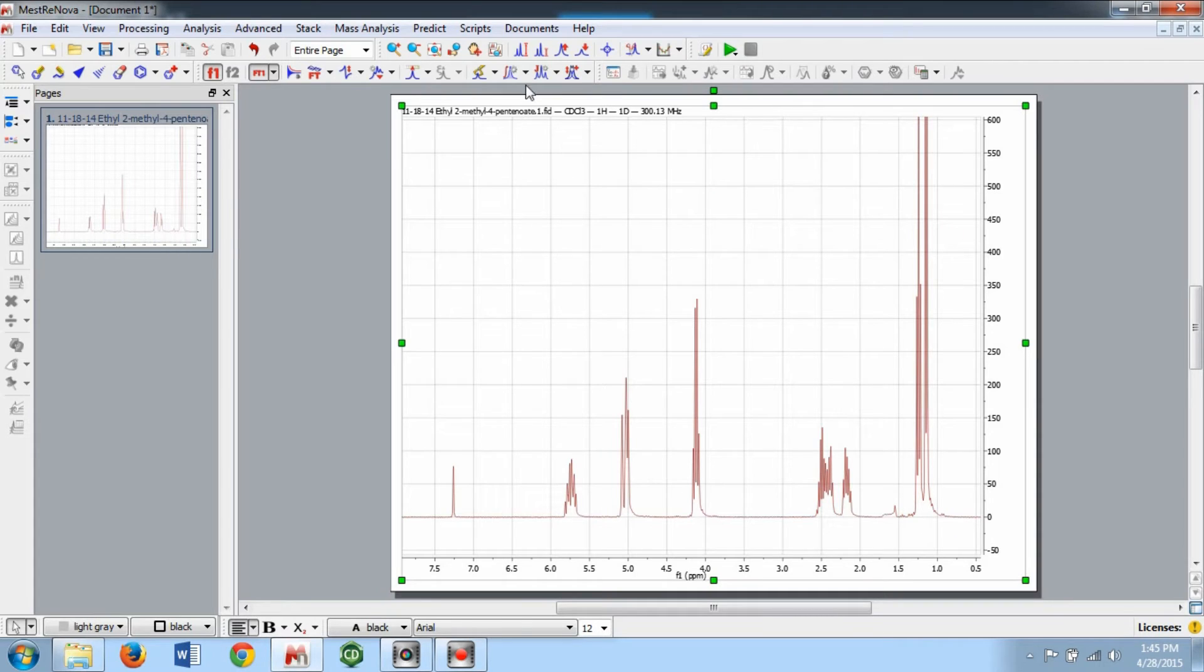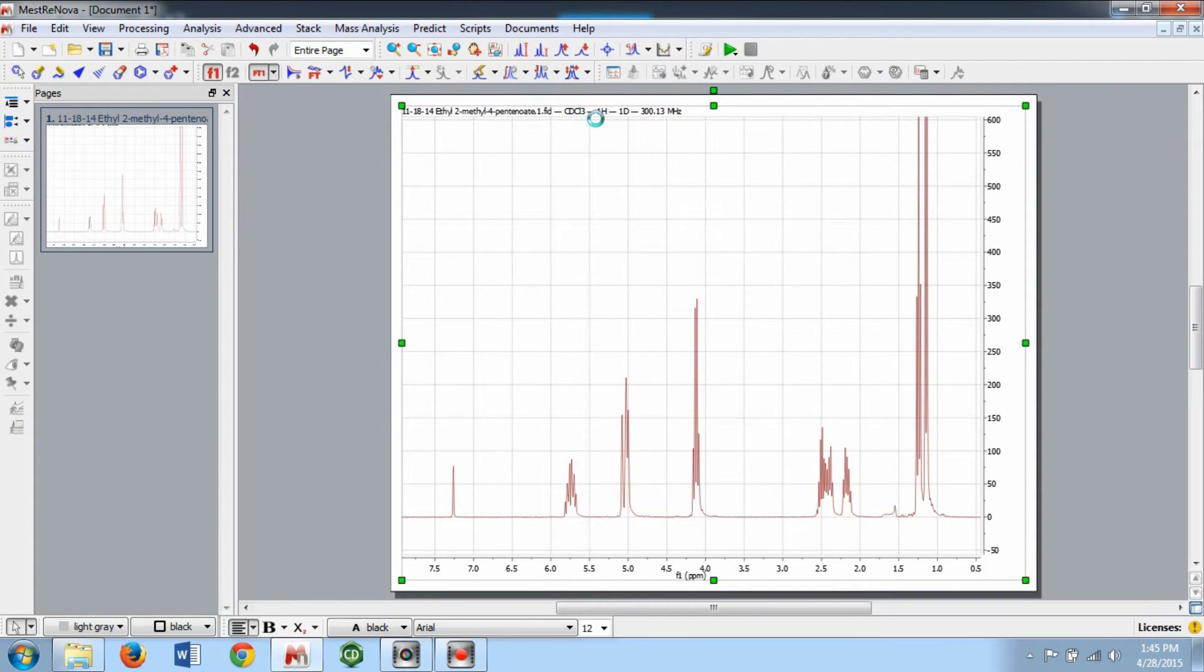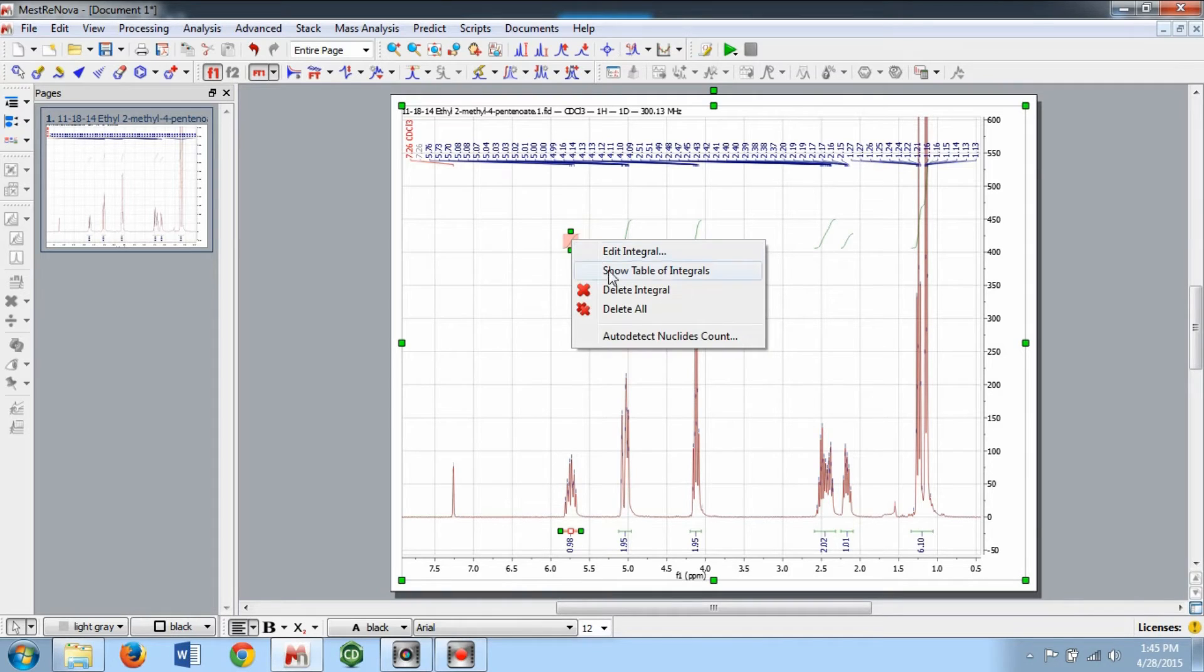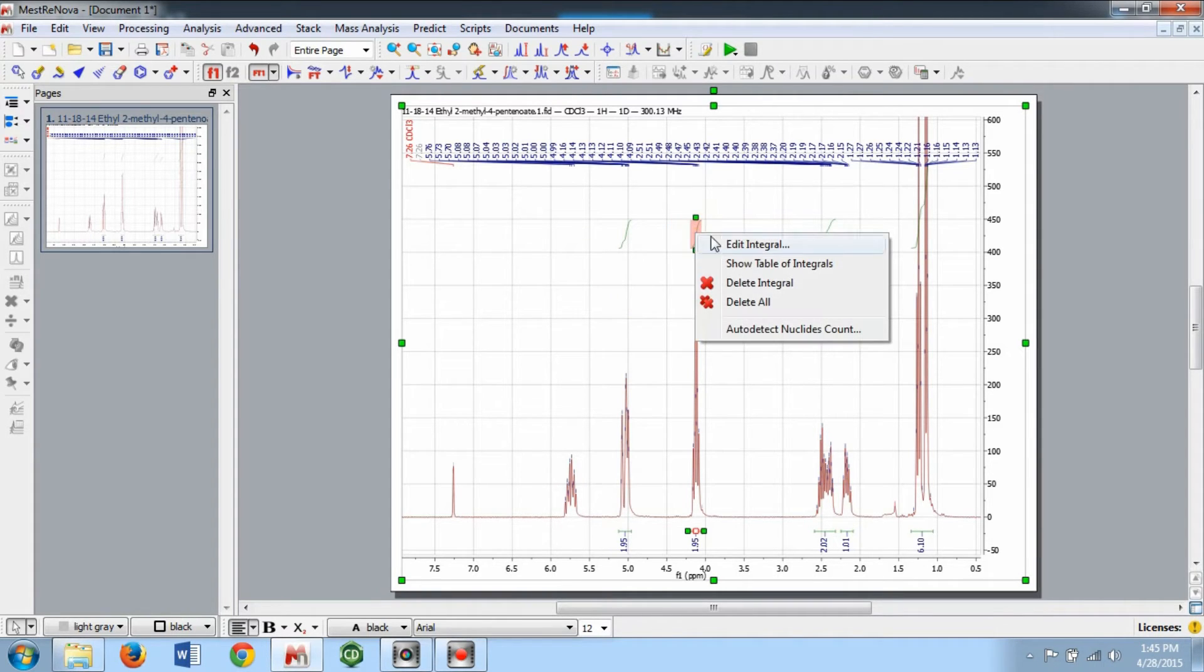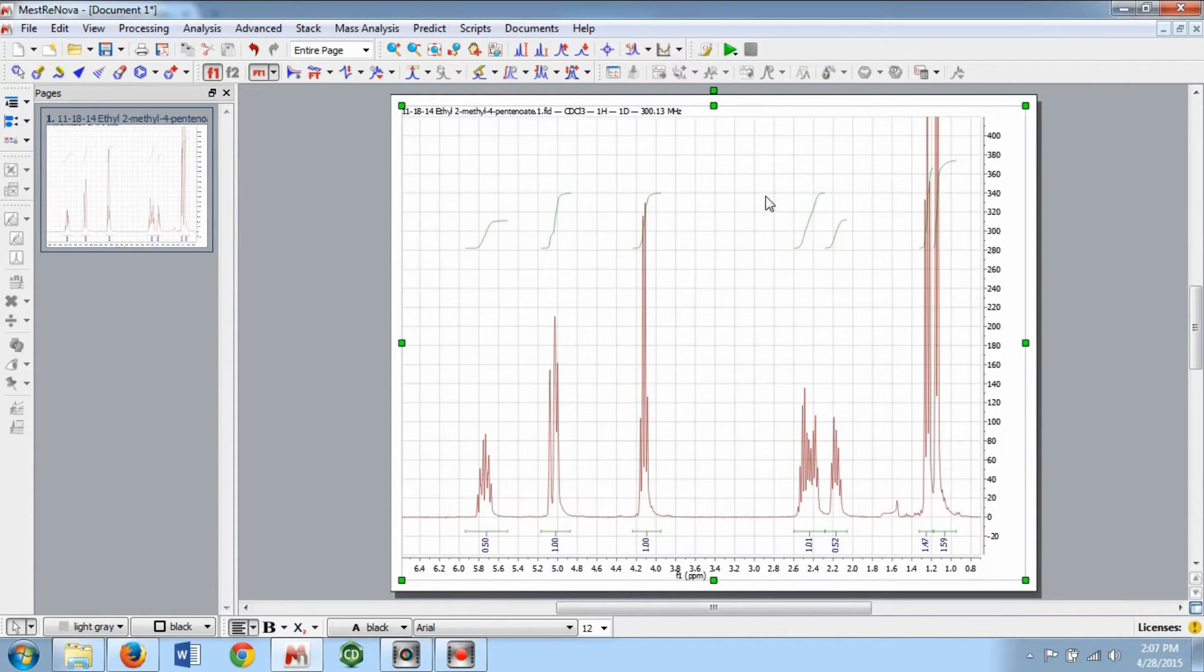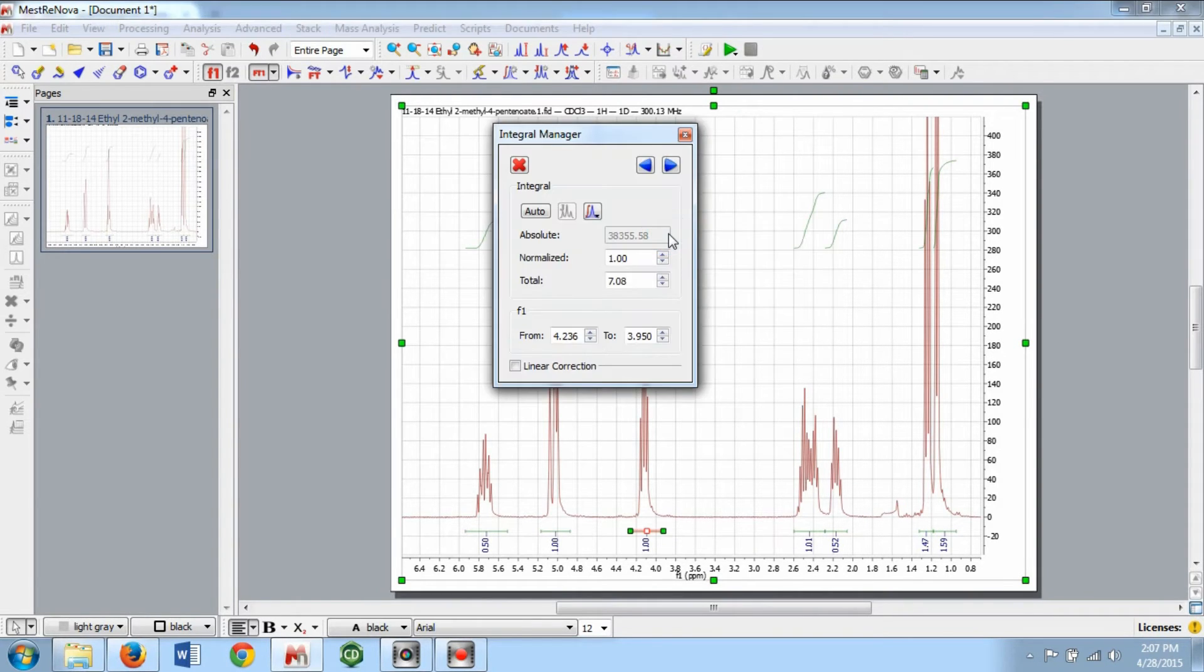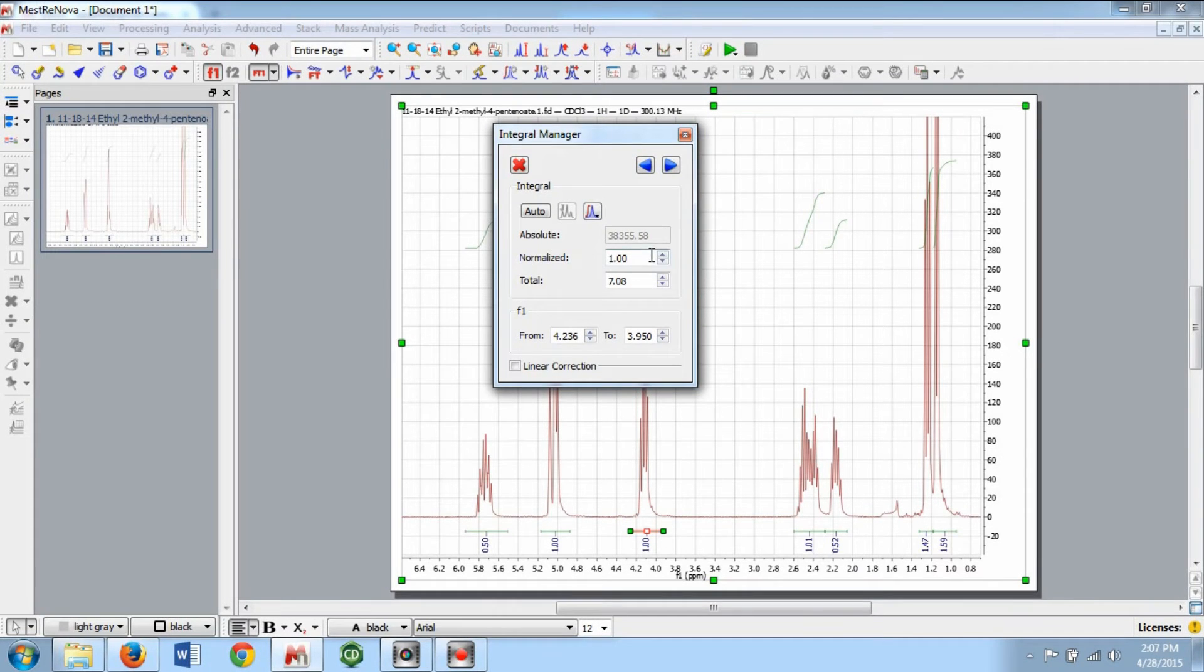The Auto Detect Regions command in the same menu will automatically integrate your peaks, but it may miss some regions or integrate impurities. To delete an integral, right click on the green integral and select Delete Integral or select Delete All to delete all of your integrals. To change the integration value, right click on an integral and click Edit Integral and change the Normalized number to represent the number of protons.